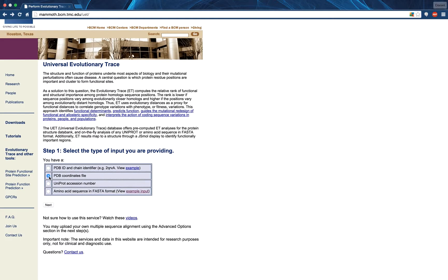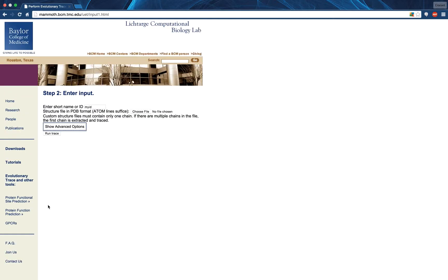We now look at the PDB Coordinates File Input page. A previously recorded video on this input type can be found in the displayed annotation. I would like to point out again that omitting an identifier when submitting your file will generate an error.